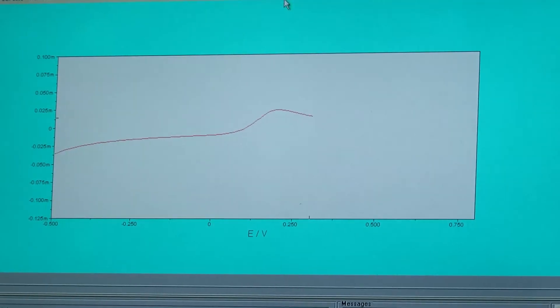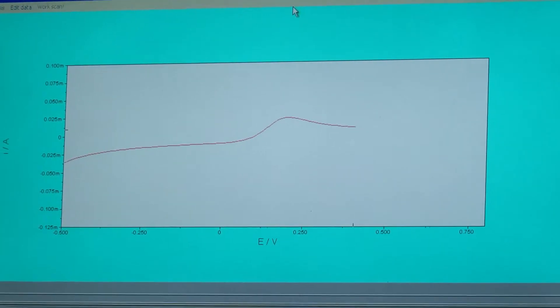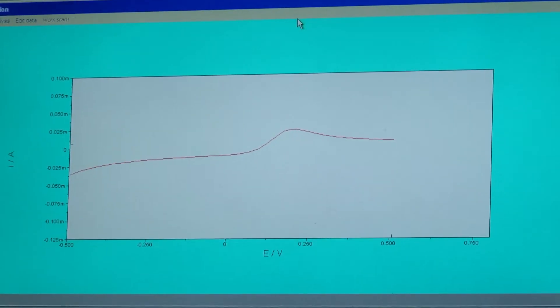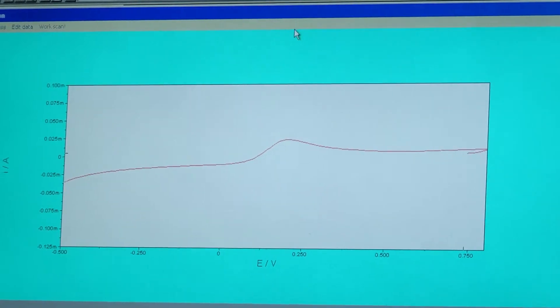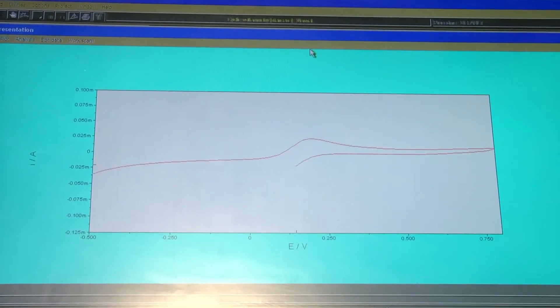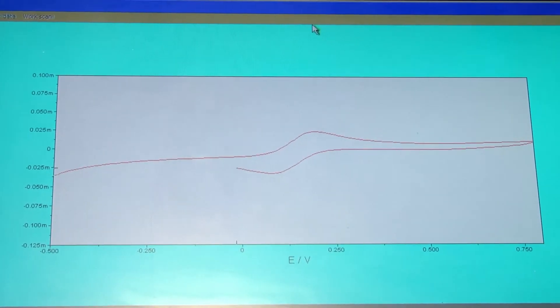It displays a beautiful peak for the oxidation reaction during the forward scan where Fe2+ is converted into Fe3+. Upon reversing the scan direction, one can see the reverse peak due to the reduction where Fe3+ is converted back to Fe2+.